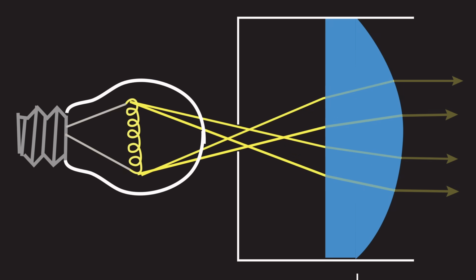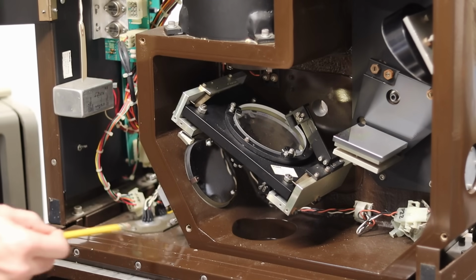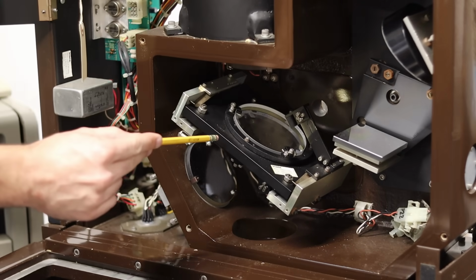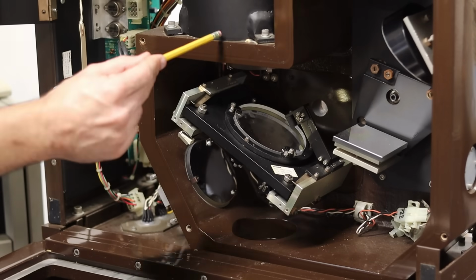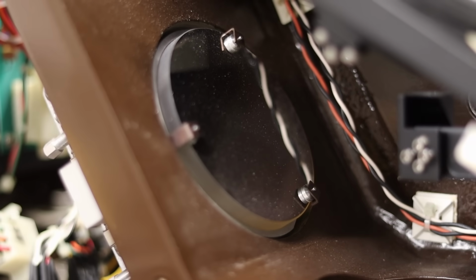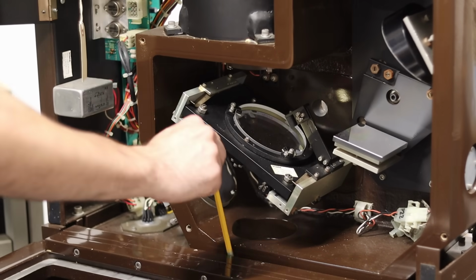This essentially takes all that electromagnetic radiation and smooths it out into a very uniform beam that it then shoots off towards this centerpiece here. And this is where the real magic happens, because this is a beam splitter. When that electromagnetic radiation hits this, half of it is reflected up into this tube, the other half passes straight through. Now in this tube and down here are two flat mirrors. The beams hit those, reflect straight back, and come right back into the beam splitter where they are recombined and shot straight down out the bottom.